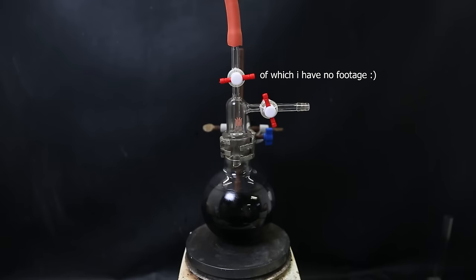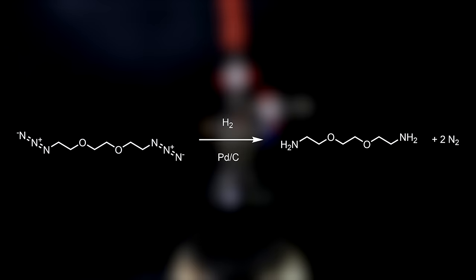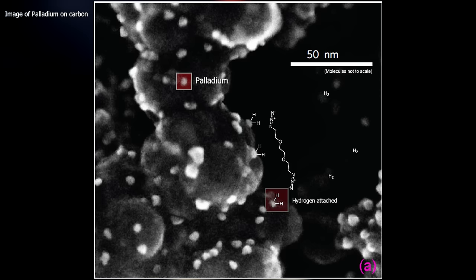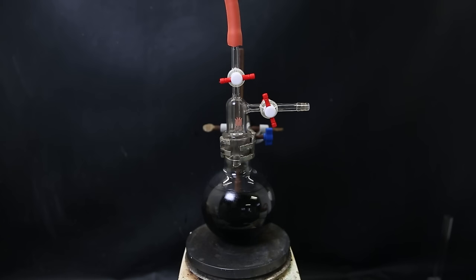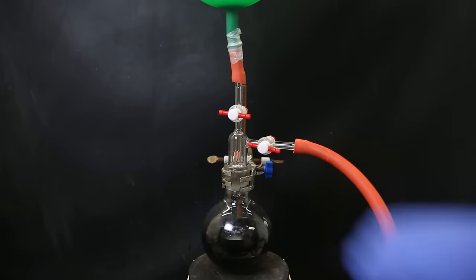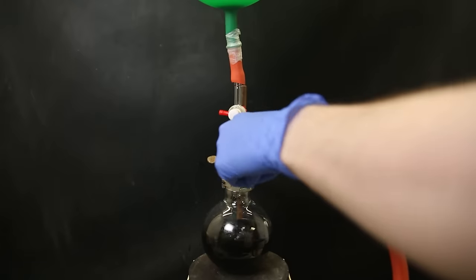In this reaction, the azide groups are simply hydrogenated to amines to form the diamine product. In general, hydrogen will attach to the surface of the palladium that is loaded onto the carbon particles. This allows for the azide to pick up the hydrogens and be reduced to an amine, while releasing nitrogen. This is somewhat annoying for this setup though, because as per the ideal gas law, one mole of gas occupies the same volume. Since for every mole of hydrogen that is consumed, it will release one equivalent of nitrogen, meaning the volume will not decrease, and so the balloon will not shrink like in a typical hydrogenation. This makes it a lot more annoying to track. So instead, I occasionally redid the pumping and filling process with hydrogen to remove the nitrogen again.